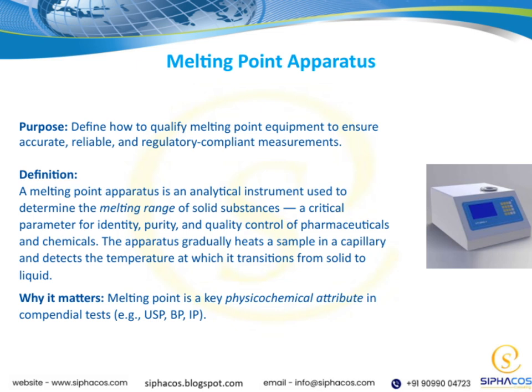Why is this important? Well, melting point is a fundamental physicochemical property that's often referenced in official compendial tests, like those in the USP, BP, or IP. Ensuring our equipment is properly qualified means our measurements are consistent, trustworthy, and compliant with these standards. So, in essence, the goal here is to make sure that our melting point apparatus is properly qualified, so the data we generate is both accurate and accepted by regulatory authorities.